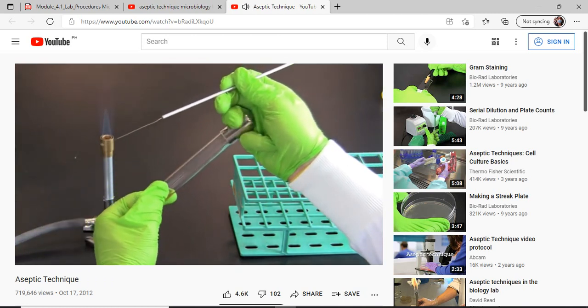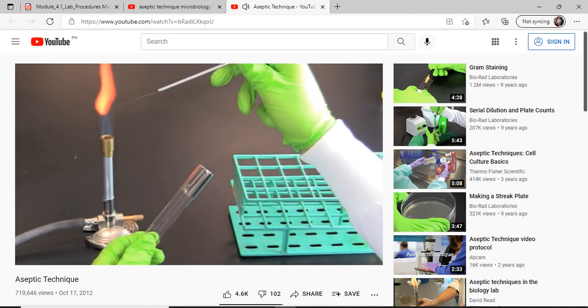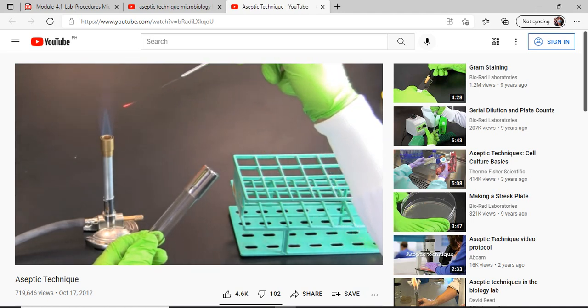Start by sterilizing an inoculation needle by passing it through a flame. Allow the needle to cool. You can test for coolness by tapping the needle in a clear area on your agar plate.